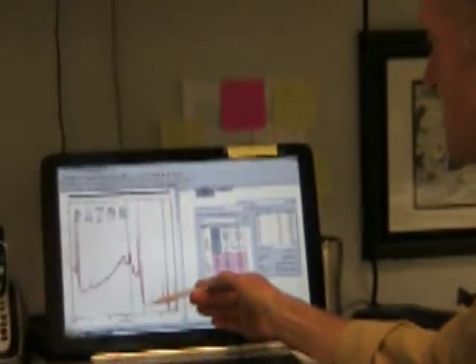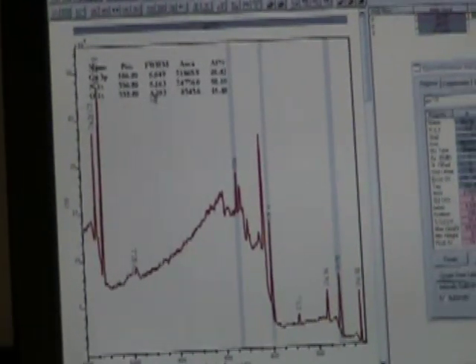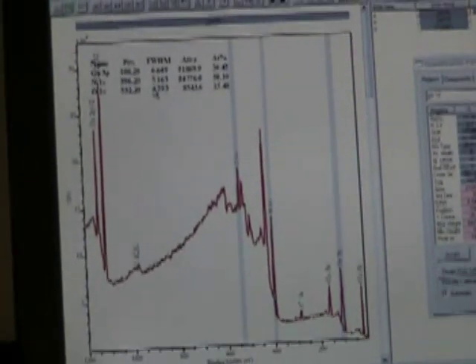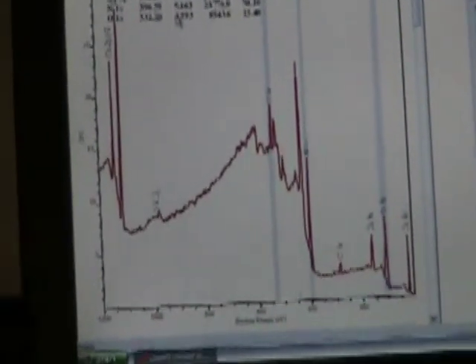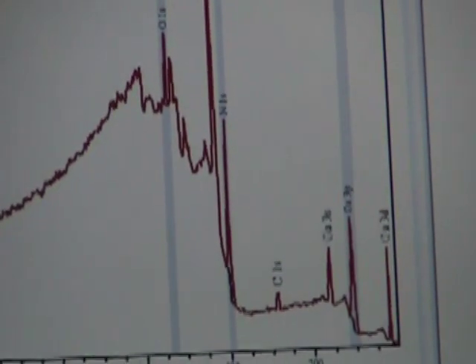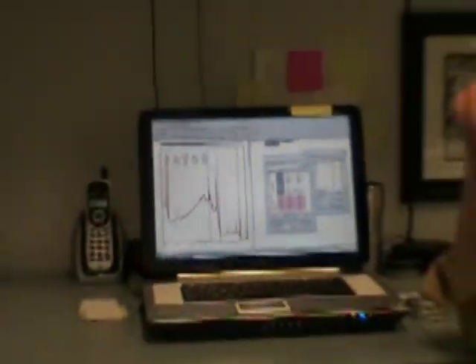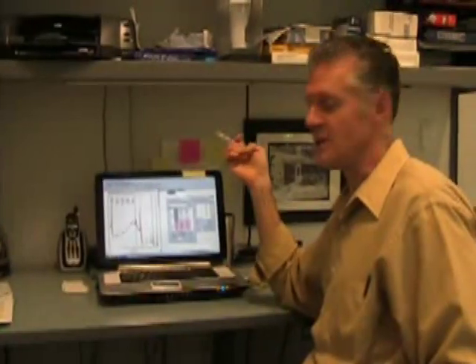And as I said before, there is a small carbon peak here. We just know from experience and also from the fact that there is no loss step associated with that carbon peak that that is entirely superficial. The carbon that's in the atmosphere is not particularly reactive and it's not going to interact with the surface really. Different story for the oxygen though, because you've got gallium atoms there, that's a metallic atom, and it will have a tendency to react somewhat with the oxygen in the air.